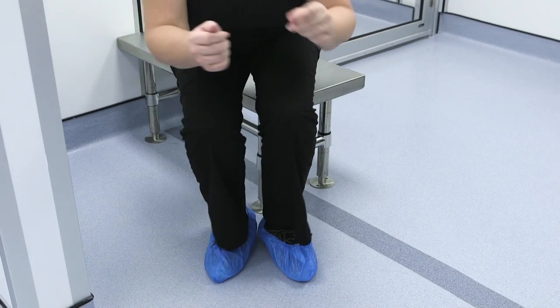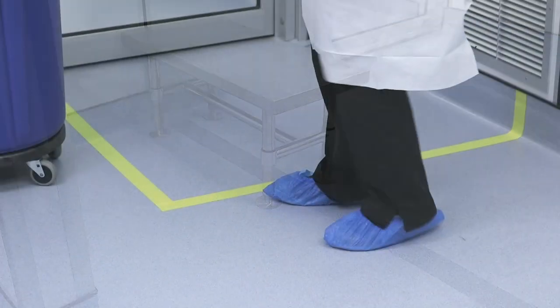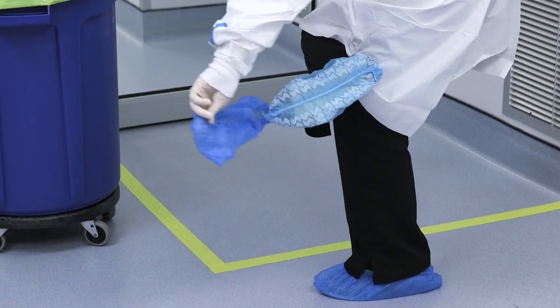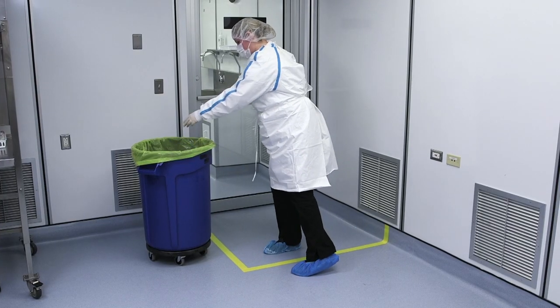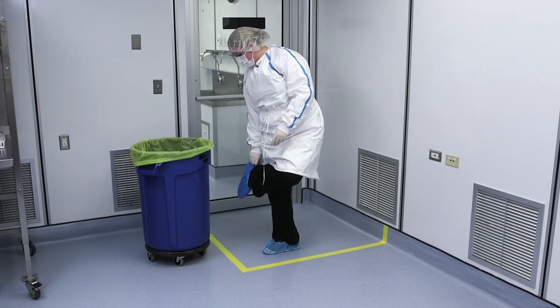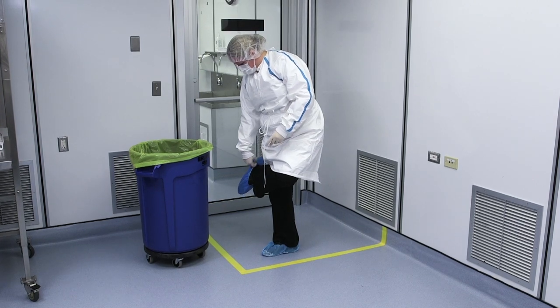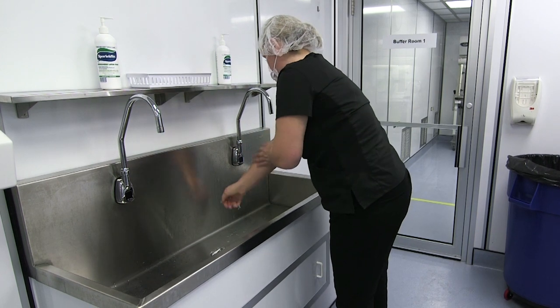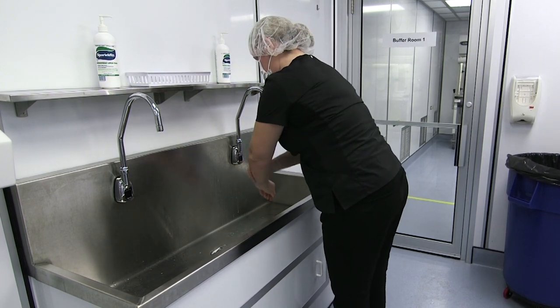This is a practice change. Two shoe covers are required so that the outer shoe cover may be removed immediately before leaving the containment secondary engineering control, therefore reducing the likelihood of HD residue being carried out on the workers' feet. Hand hygiene is performed in the same manner as required under Chapter USP 797.